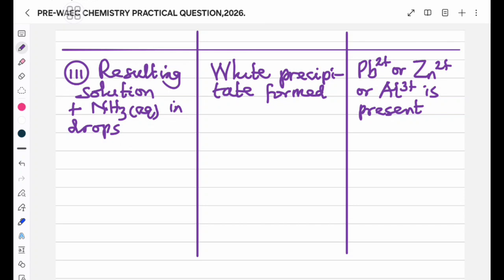A simple inorganic salt has one positive radical or ion and one negative radical or ion. Now, when you are listing the ions, don't use 'and'. Never say Pb2+ and Zn2+, because it's only one of them. We are still debating which of them is likely present. We will later confirm the one that is actually present, having carried out adequate tests.